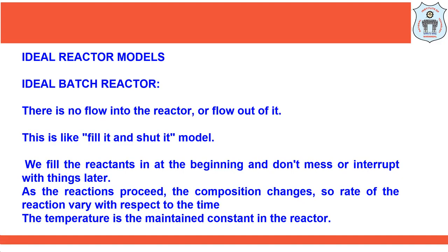This is like a fill-in and shut-in model. We fill the reactants, close it, allow the reaction to take place, then we stop the reaction, and then we withdraw the products. So it is a filling and shut-in model. We fill the reactants into the system at the beginning, and at the end of the reaction we take out the products. As the reaction proceeds with respect to time, the concentration of the reactant will keep decreasing, and the concentration of the product will keep increasing with respect to time.